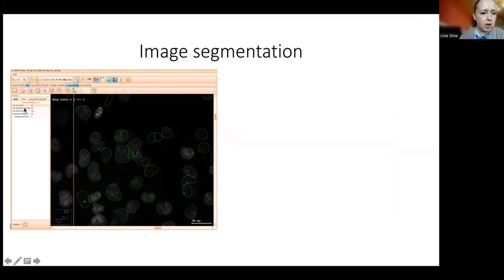Here, you have to change use mask to no, and choose the nuclei mask for detecting the signal. Then you have to optimize the background threshold depending on the characteristics of your sample. And we obtained a good mask using the background threshold of 5 for our images.